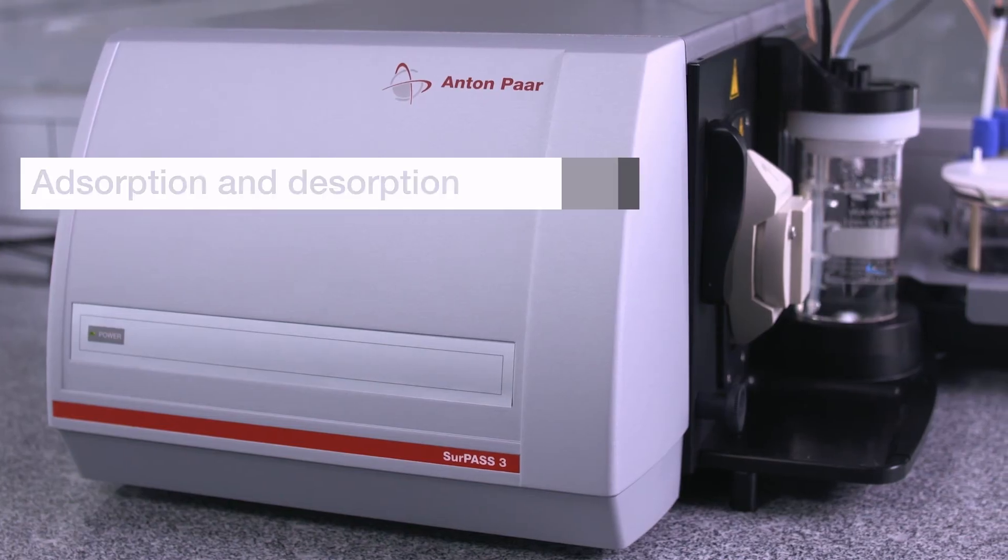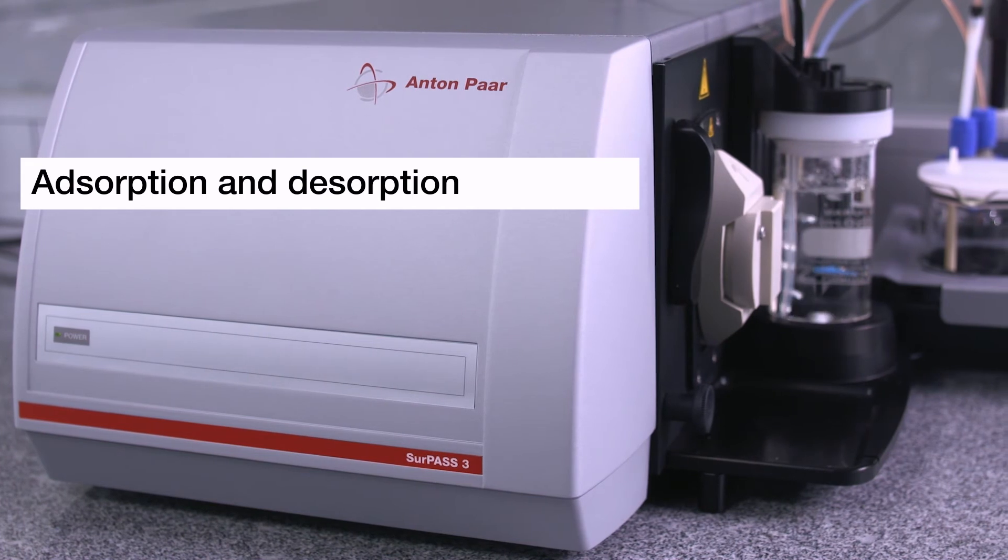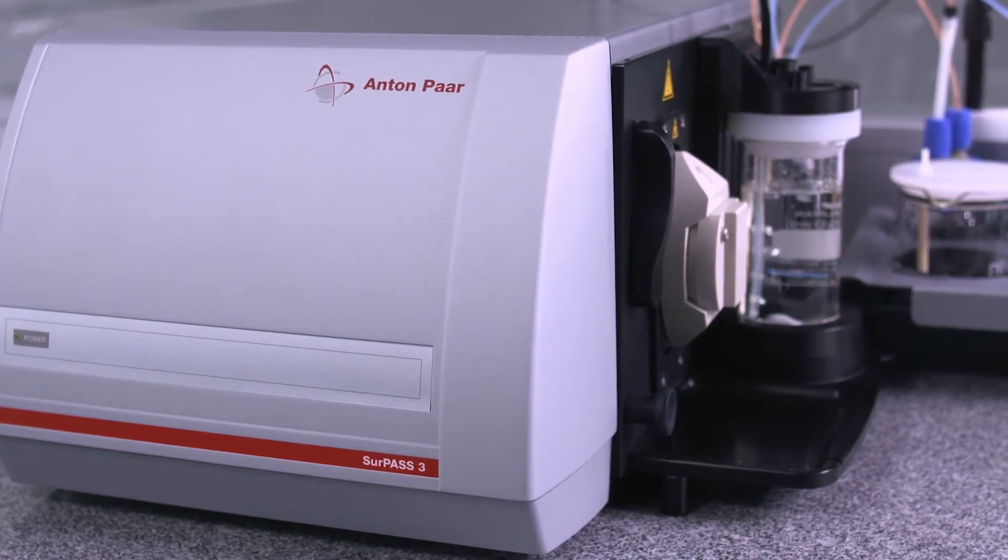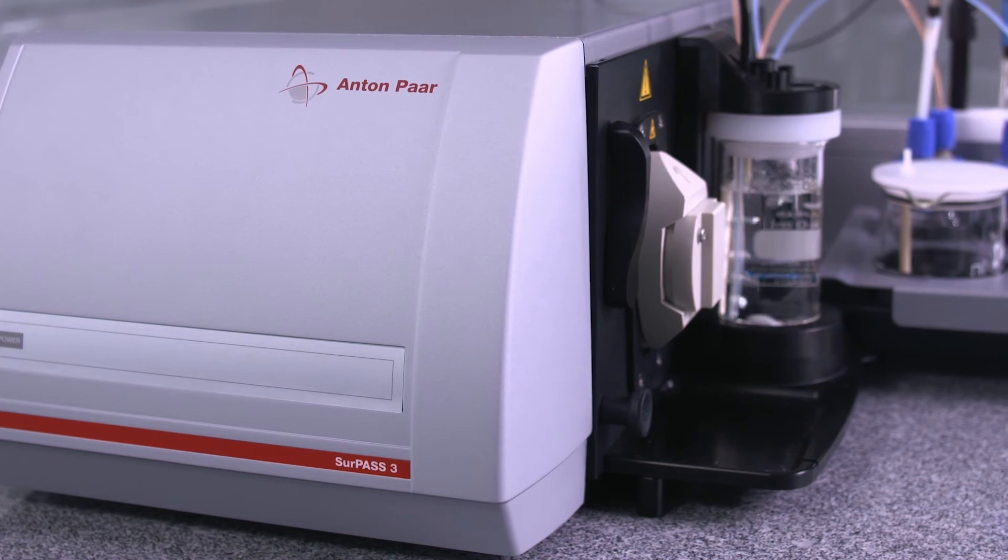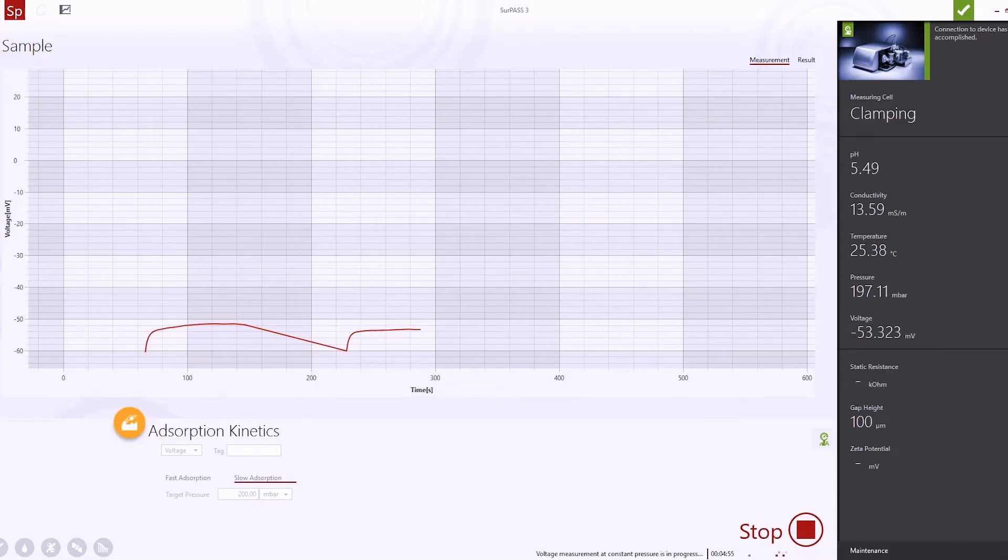The surface zeta potential also enables the real-time analysis of liquid-on-solid surface adsorption and desorption processes. Time-resolved adsorption measurements have applications in different fields, including biomaterials where protein adsorption is of interest, or in the textile industry, where this technique enables the simulation of a complete washing cycle for laundry.